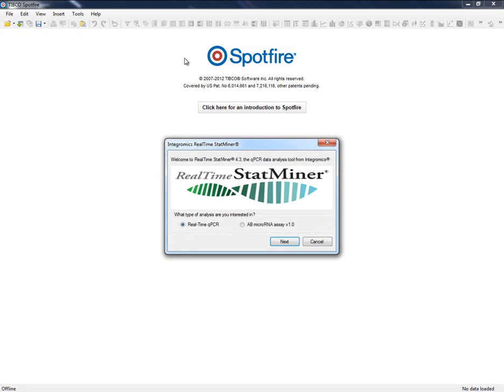Everything we need to configure our analysis is accessible from the StatMiner wizard. From this wizard, we will load our data, define the experimental design, and configure the analysis settings. Once configured, the wizard will automatically run the analysis, presenting us with all the analysis reports which are organized in tabs.